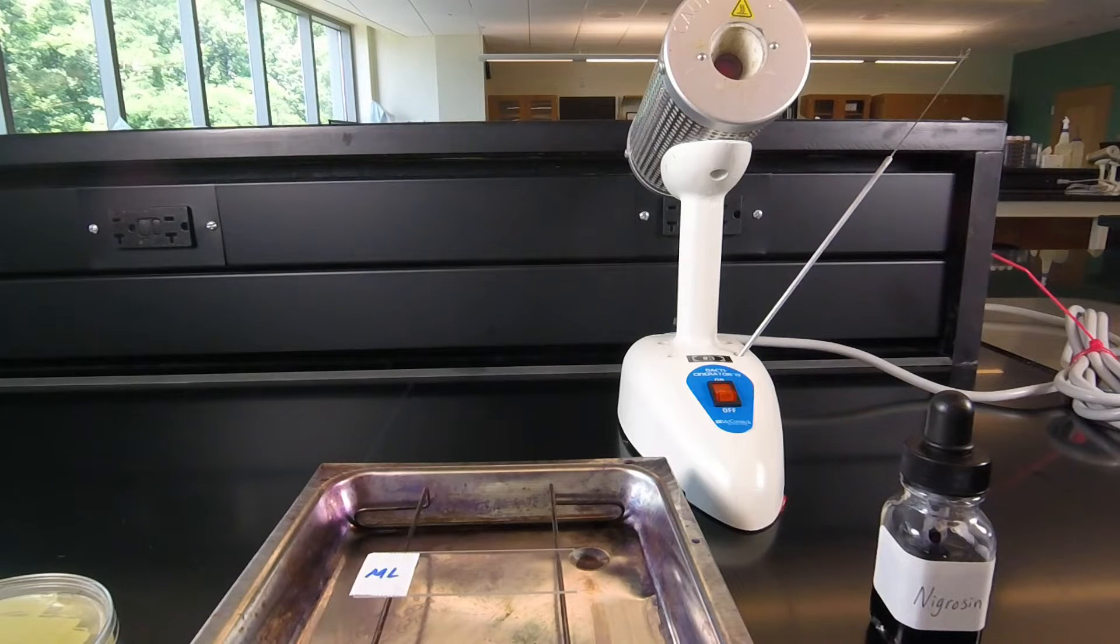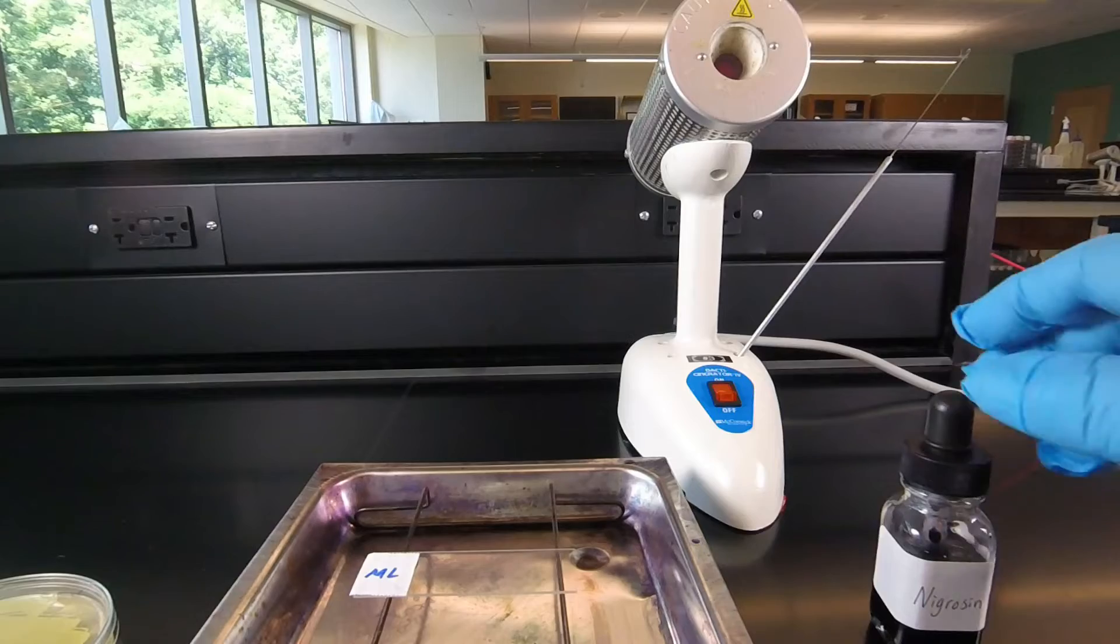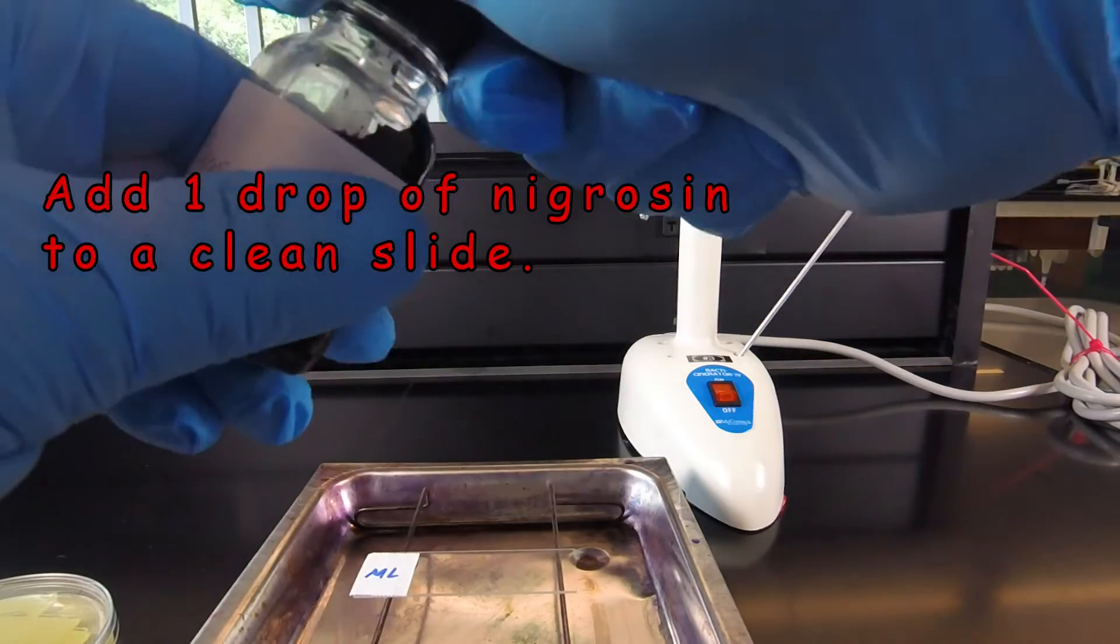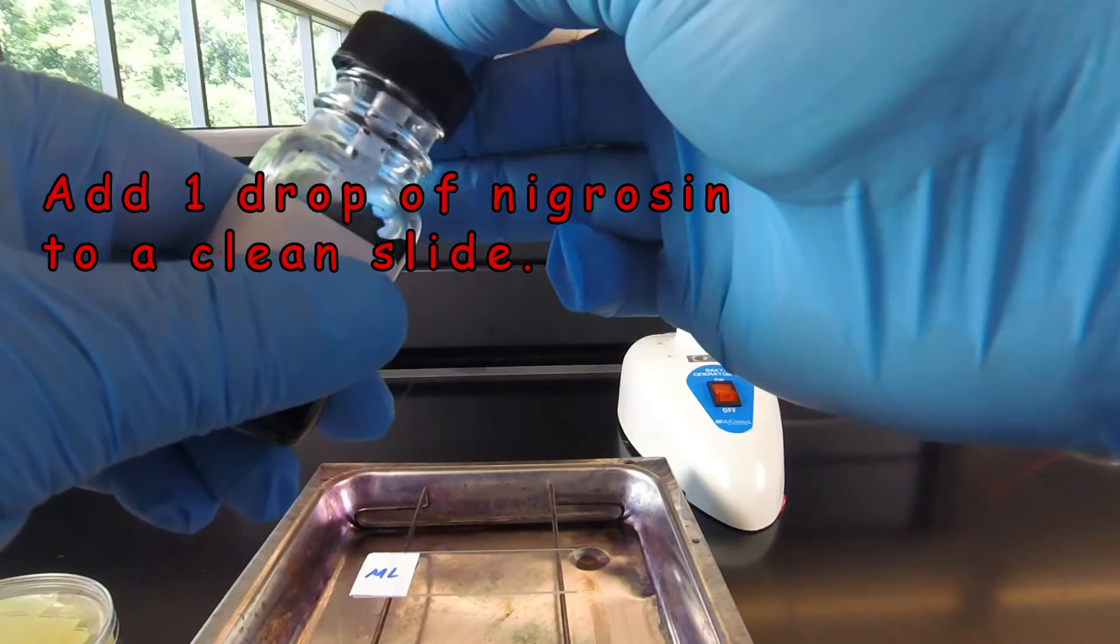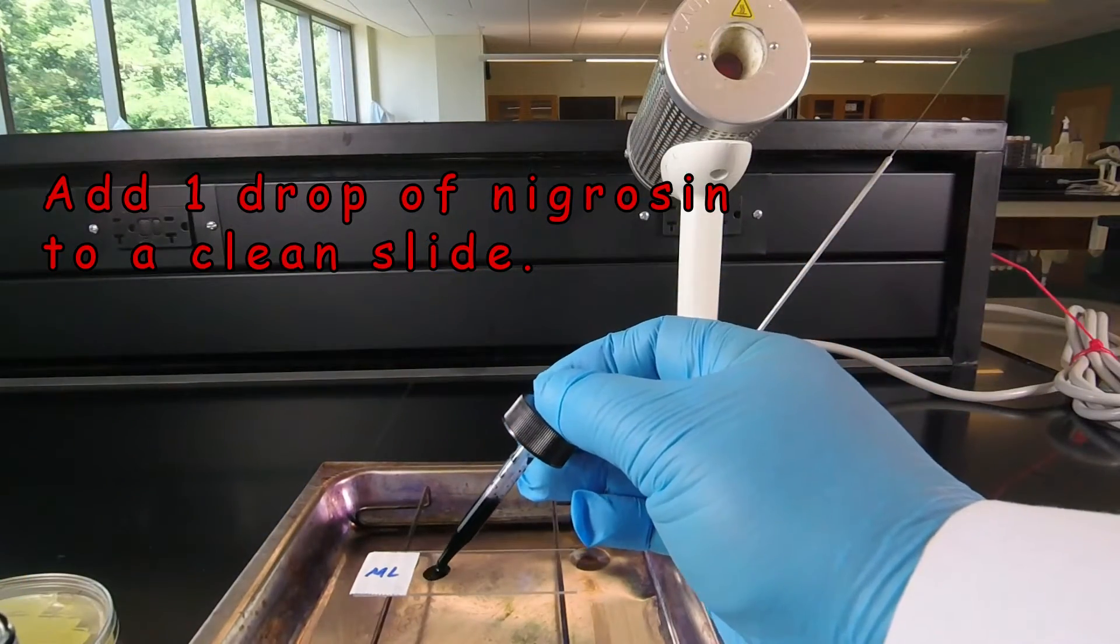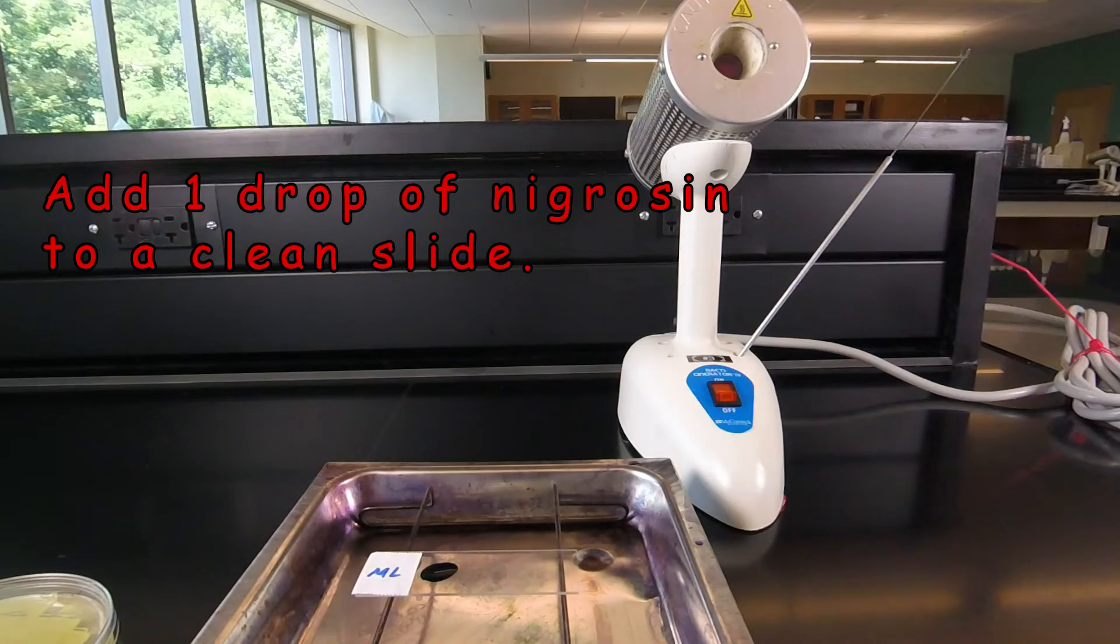So when performing an indirect stain, we start out by adding a drop of our acidic dye Nigrosin to the slide instead of water. We add a nice little drop full up near the top of the slide.